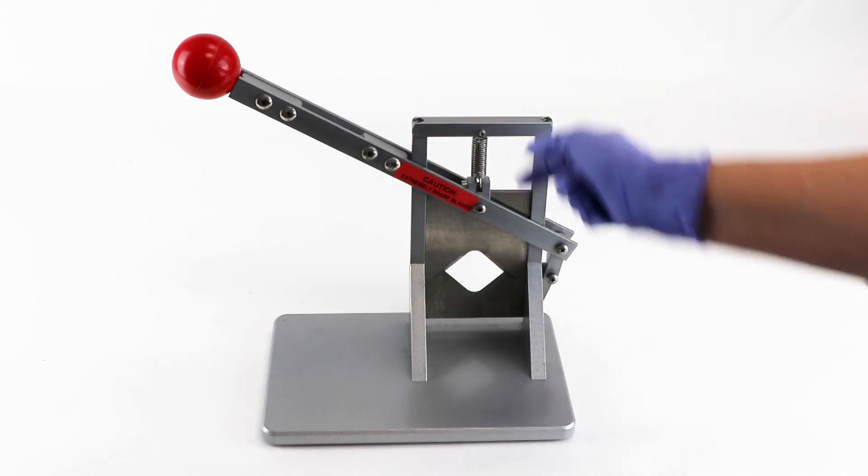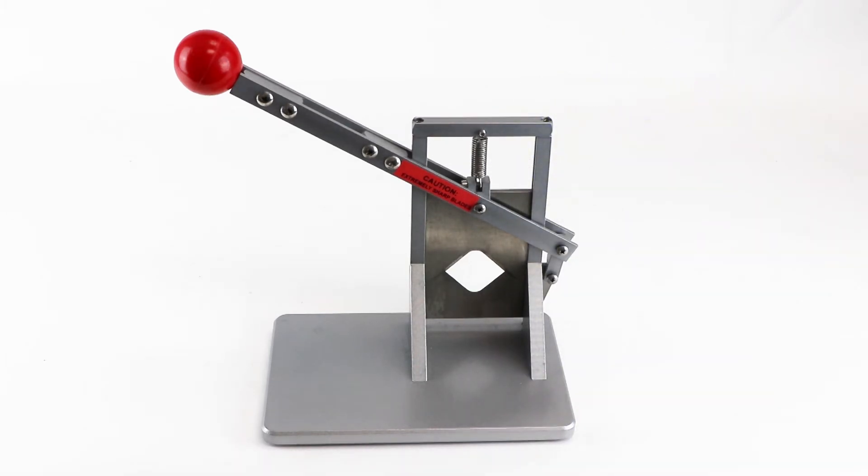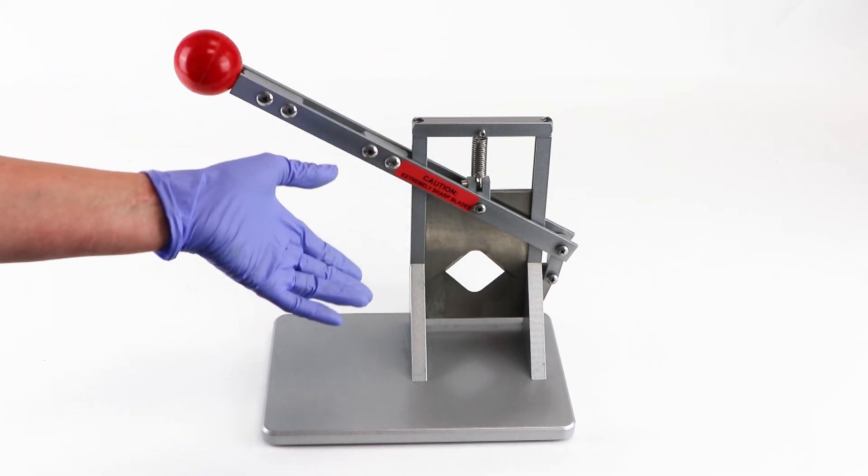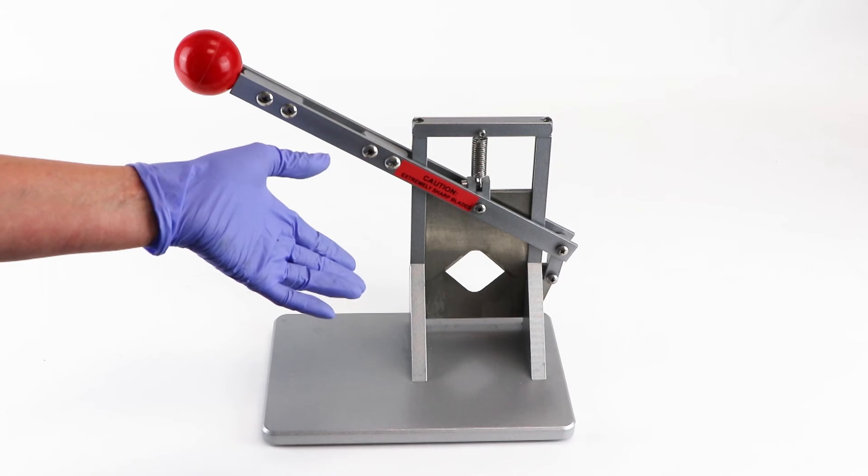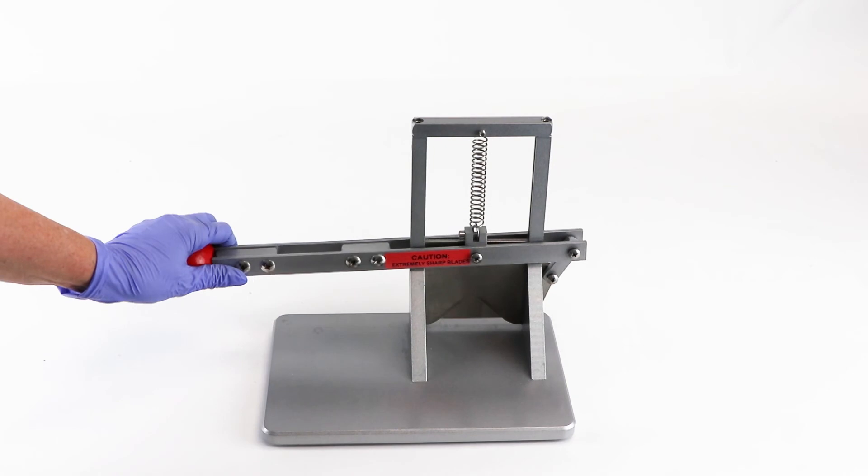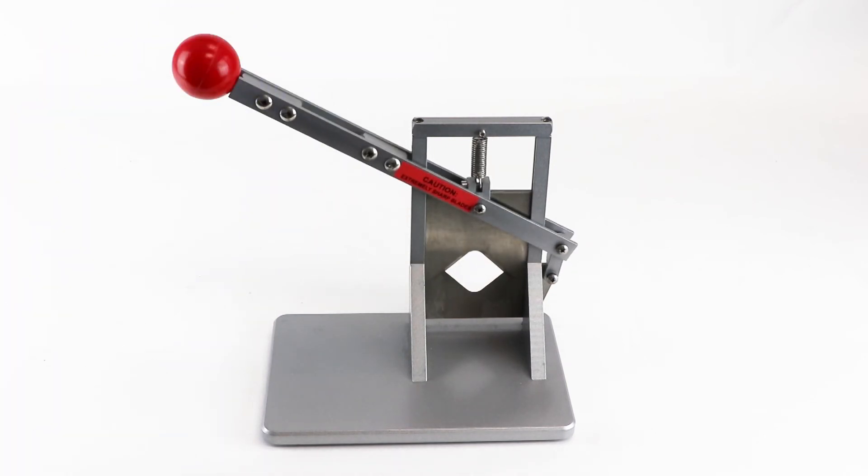This prevents the blade from accidentally falling and injuring laboratory personnel. It also makes it quicker to dispatch the subject, requiring only a single downward action. This guillotine is designed specifically for laboratory work.